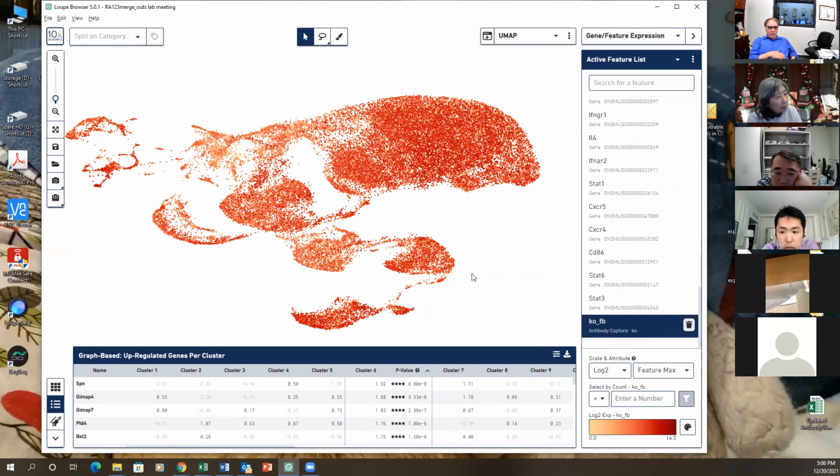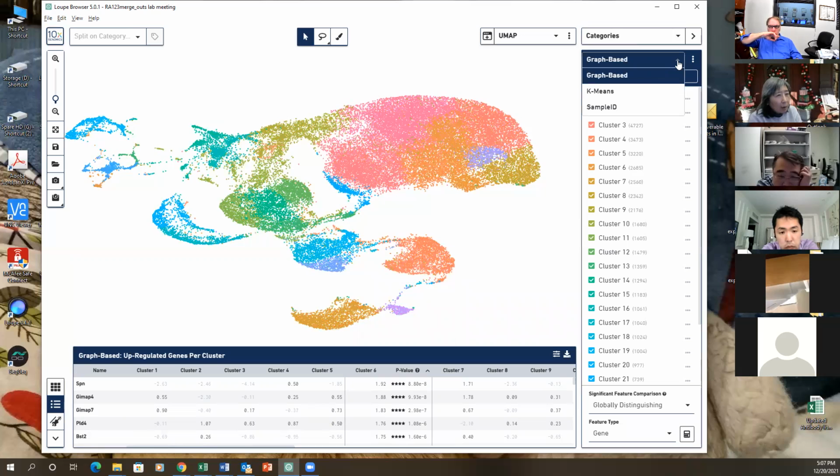Okay. So knockout. I think they're completely merged, right? What are we looking at here? Yeah, they're almost 6 mice. Each knockout is 3 mice merged. Oh, that's a knockout. Okay. This is knockout. Can you separate them, like you do, move side by side? Yeah, separate that. I have put it in a box, but it's not finished, so then I shut it down.